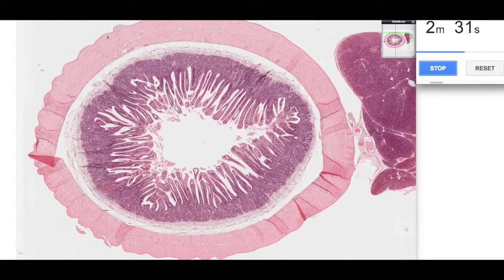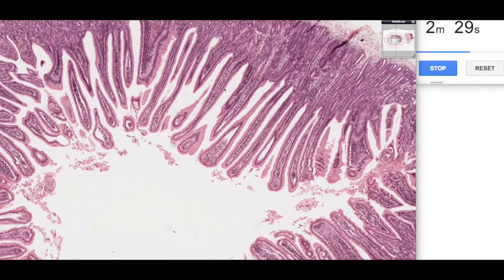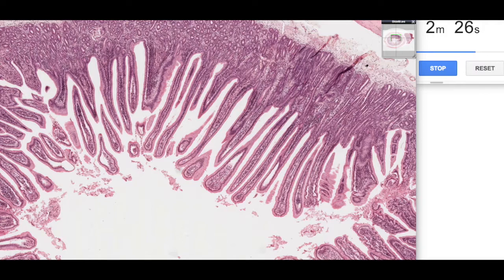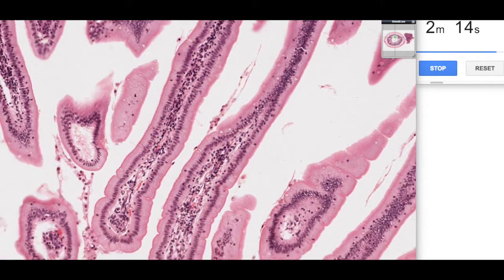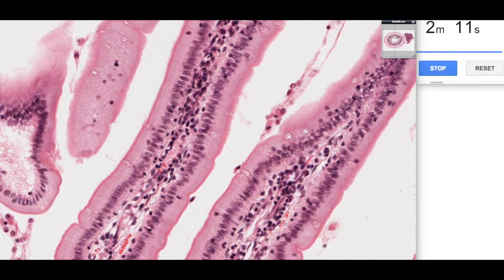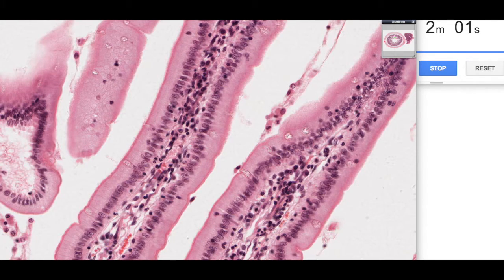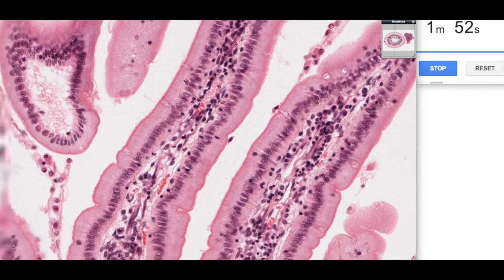If we zoom in a little bit for finer detail of the mucosa, we can see these projections — the villi — which increase surface area for absorption. Zooming in further, we can see they're lined by a simple columnar epithelium: here's the nucleus, here's the cytoplasm. This very acidophilic top is what we call the brush border, representing the microvilli on the surface of these absorptive cells.